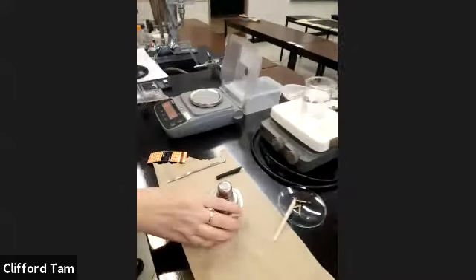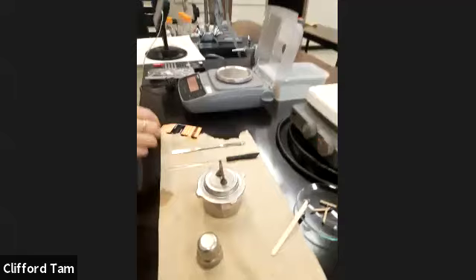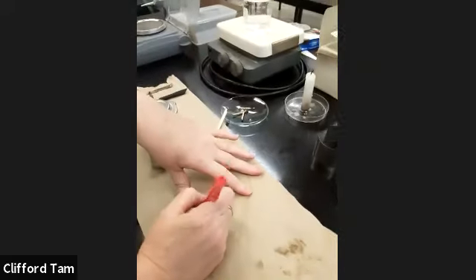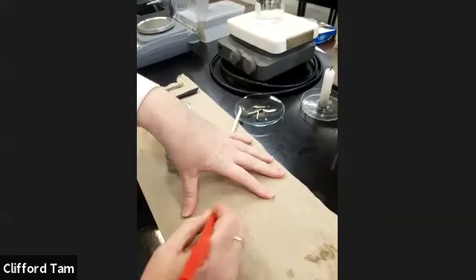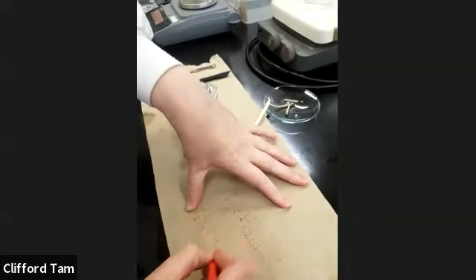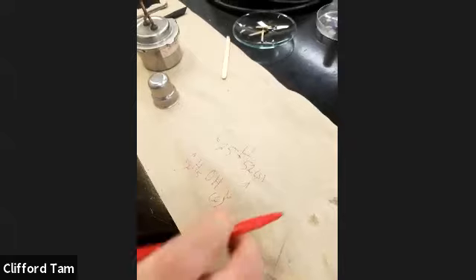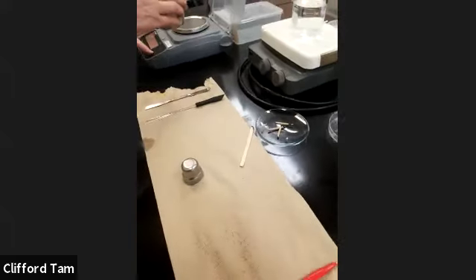Now this is a different fuel. Okay? What fuel are we using right now, Xantha? This is ethanol, C2H5OH. Yes. So Xantha's writing out the formula for the paraffin, which we burned first, and now she's going to write out the amount that she's burning for the ethanol. Okay, and the states are important, and the size of the molecule. Right. So this has to do with the nature of the reactants.